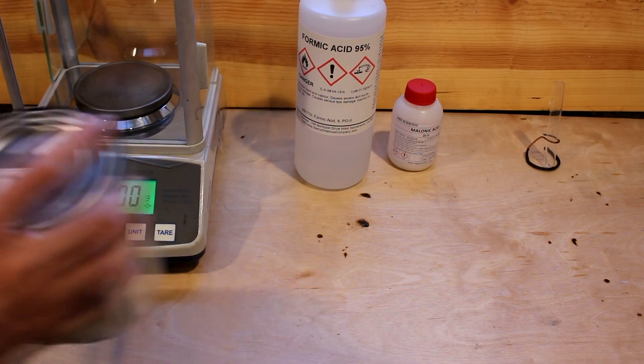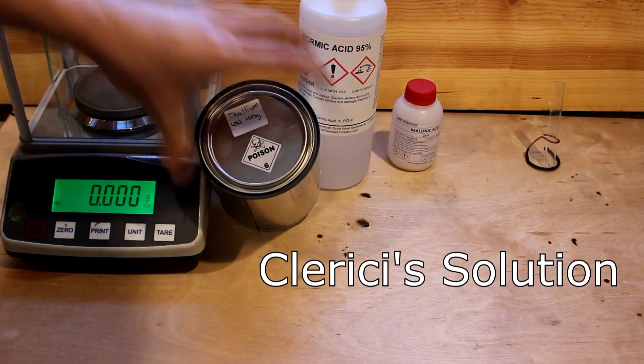Today I'll be making the densest water-based liquid that I know of, and that is Clerici's solution.